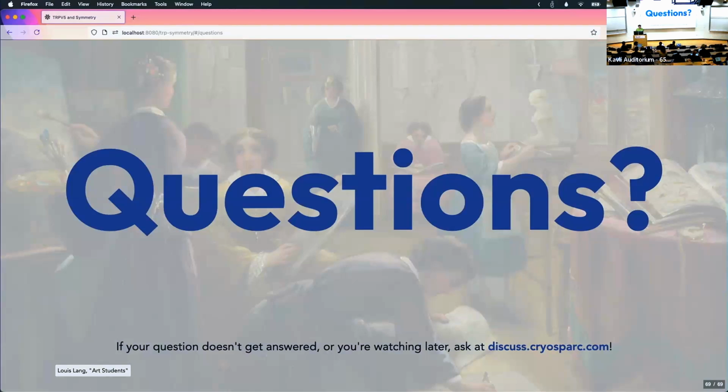So were you asking about the filter resolution? Regularization factor is more like how much should we trust our really noisy data? Ollie might want to give a more formal definition, but basically the idea is that if you really wanted to, you could say I only want to use my data, and I'm not going to use anything we know about the protein, like that it should be smooth. Filter resolution actually is very similar to pixel size. It's literally doing the same thing.